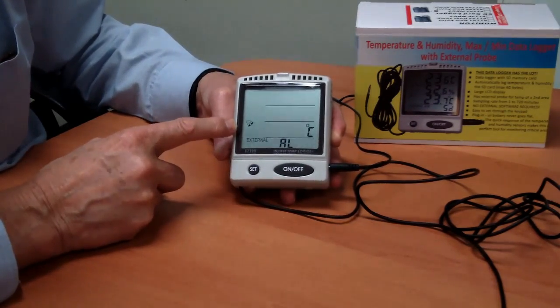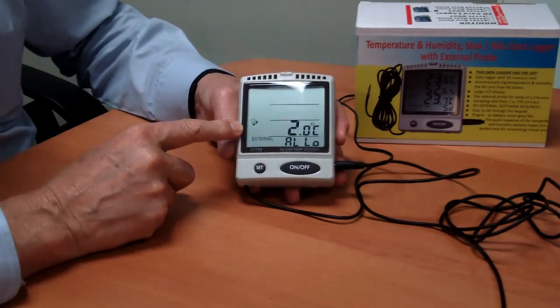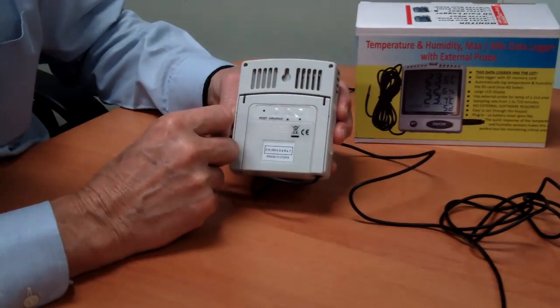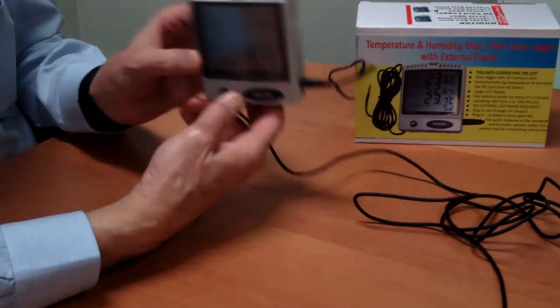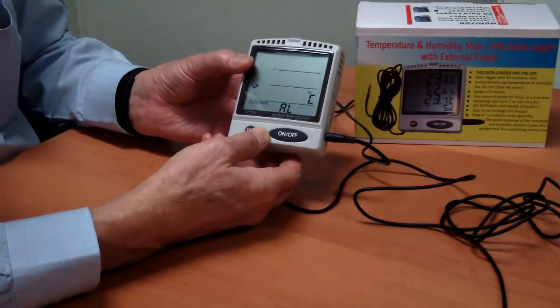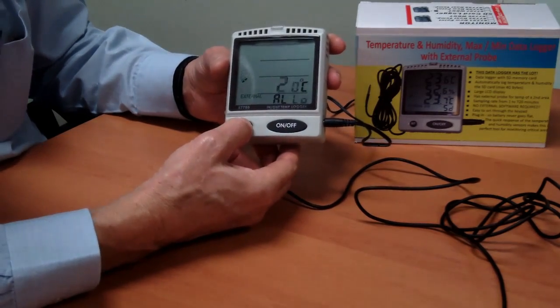Now we're talking the temperature that we want to set. So this is alarm low. Now it's currently set at 2 degrees C, which is correct for vaccines. Now if you need to adjust it, you turn the unit around, and on the back we have up and down arrows and buttons. So by pushing the up and down arrow buttons, we can change the temperature. So let's increase that or decrease that down to 1.5 degrees. Pushing the up arrow, I can bring it back to where we want it, which is 2 degrees. I'm happy with that, so I push set.